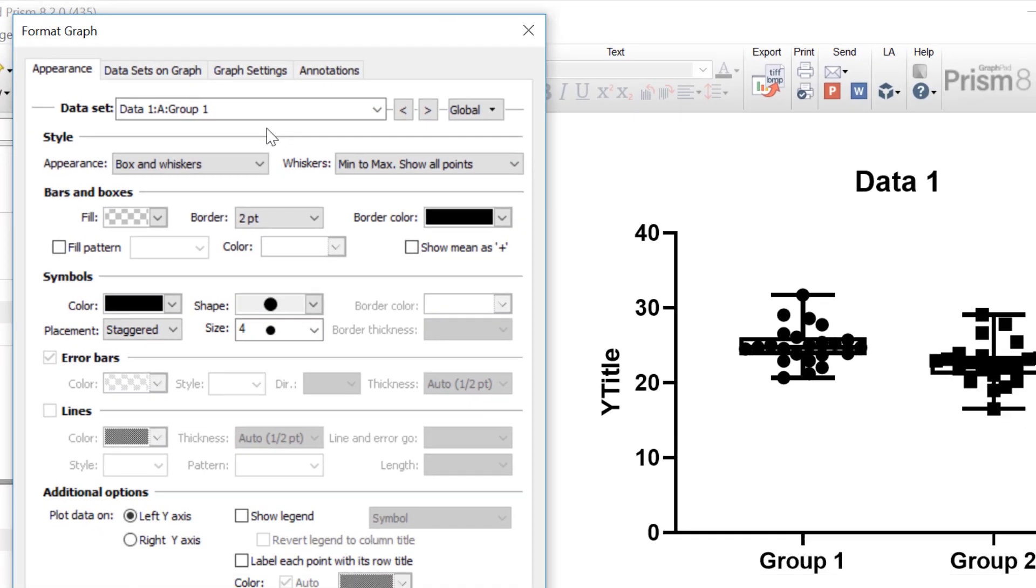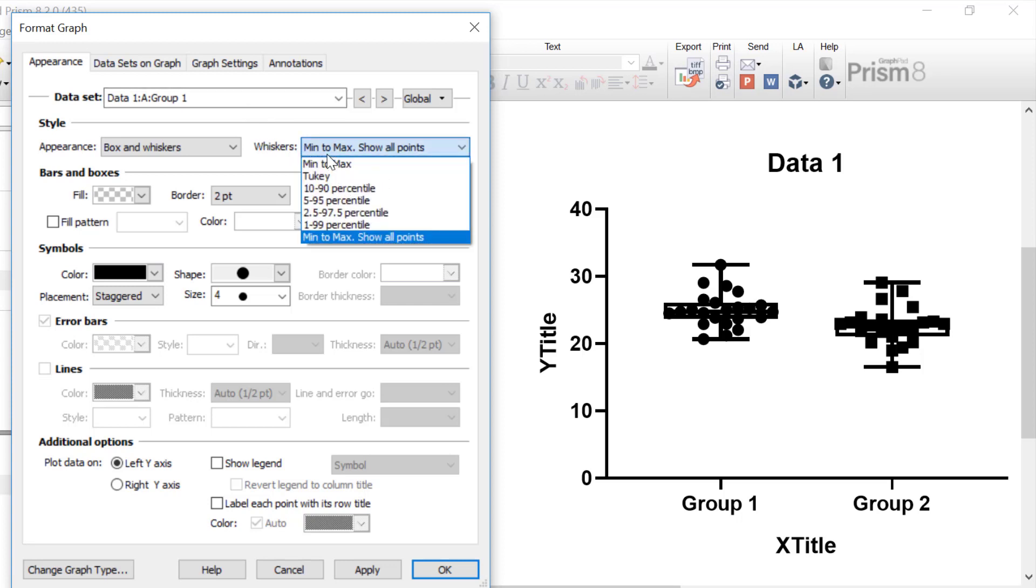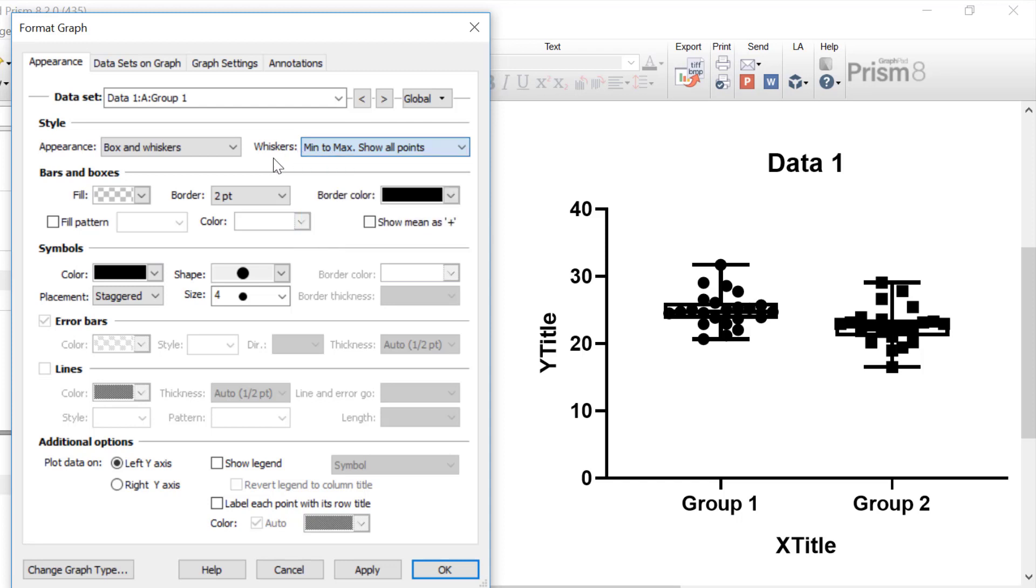So with the format graph window open, it is here that you can change the appearance of the box and whisker plot, including the color of the bars and the boxes, as well as the symbols if you have superimposed them onto your graph. With my first group selected, I can change what the whiskers represent, as previously shown in the wizard. Again, I'm going to leave this to minimum and maximum and show all points.